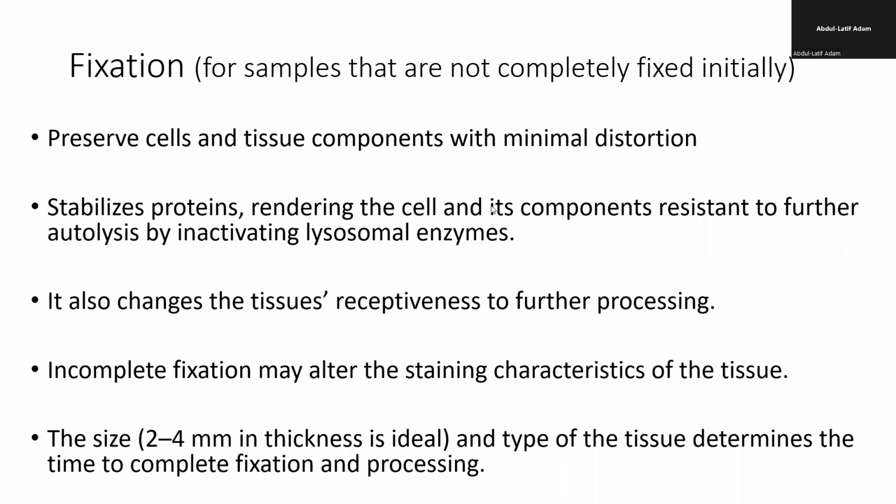So when you do fixation, even though there is a bit of water in it, fixation helps to preserve the cells, okay? Before you are able to examine a tissue and tell that it has this abnormality, it has to be in a state as if it is living, as if it is in the body.